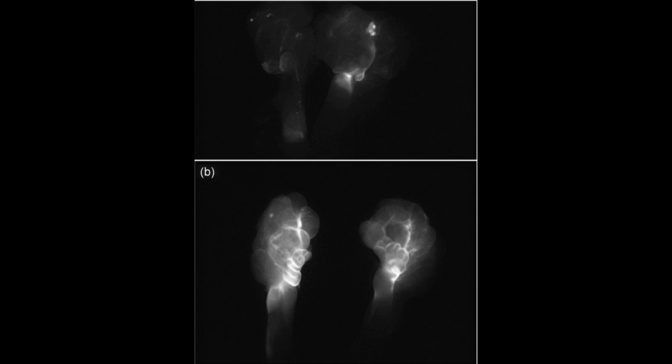Microscopy is used as a tool in almost all biological studies, ranging from inspection of cellular detail for tissues to fluorescent dyes that bind to specific proteins or other targets. It is also commonly used for studying live cell cultures.